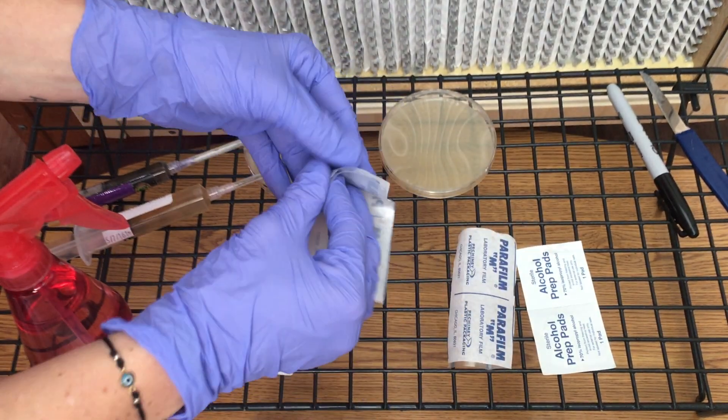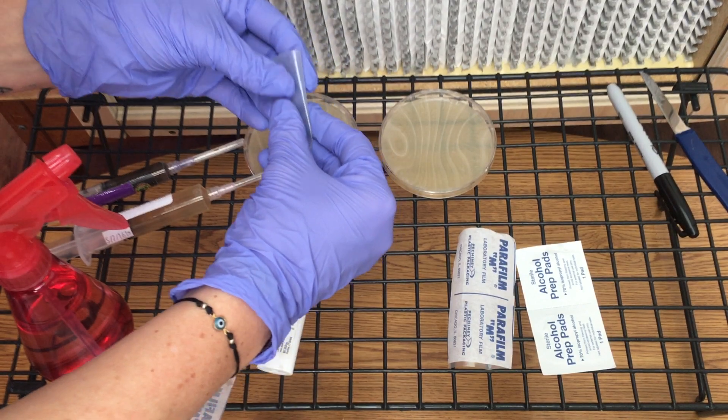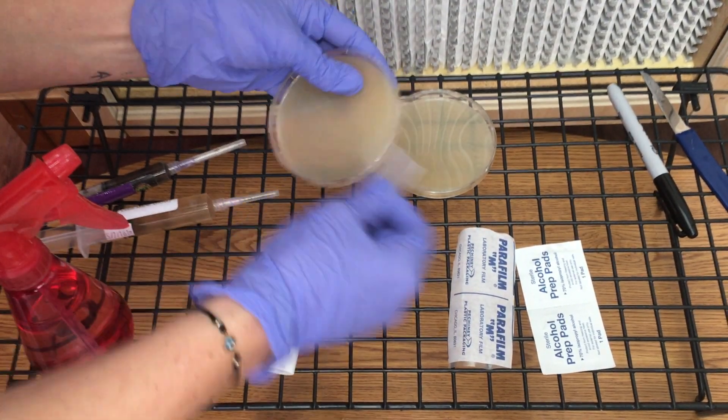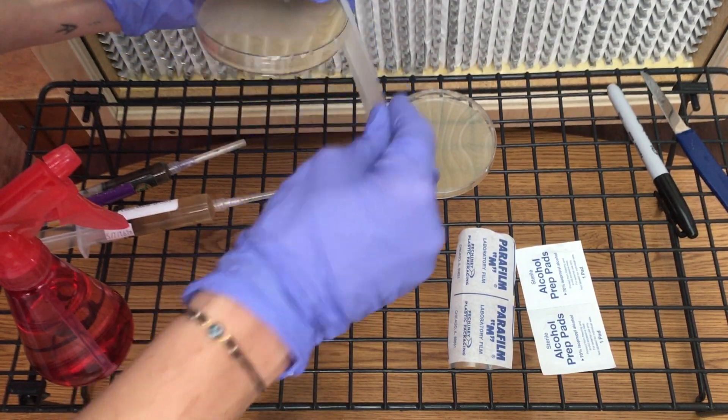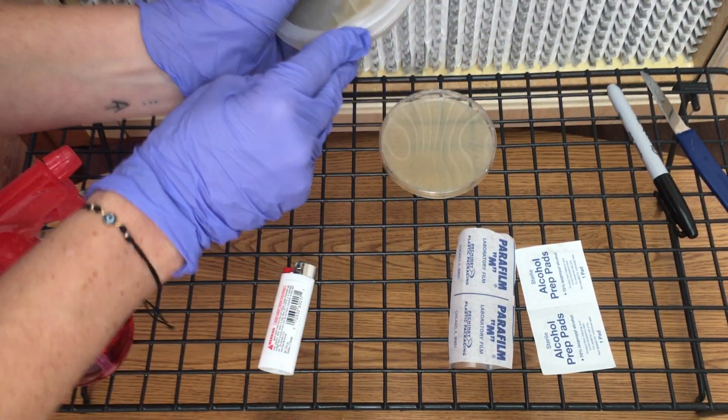go ahead and wrap the petri dishes with parafilm and then set your petri dishes in a dark warm place, about 77 to 82 degrees Fahrenheit, and watch your mycelium grow. You should start to see mycelium growth in about five to seven days.